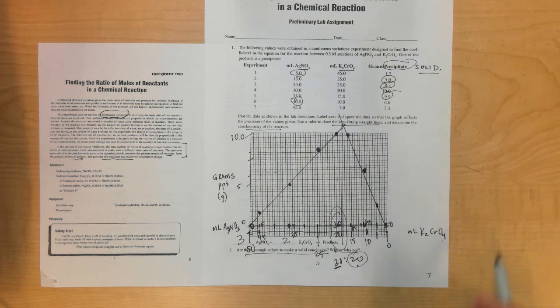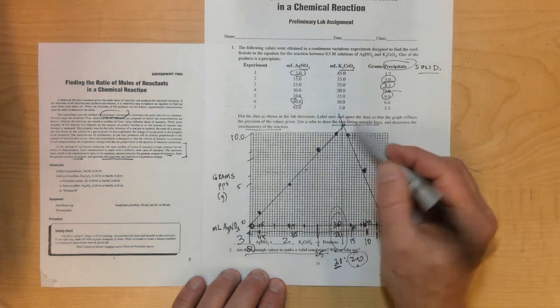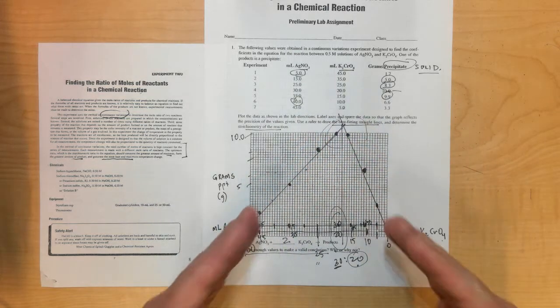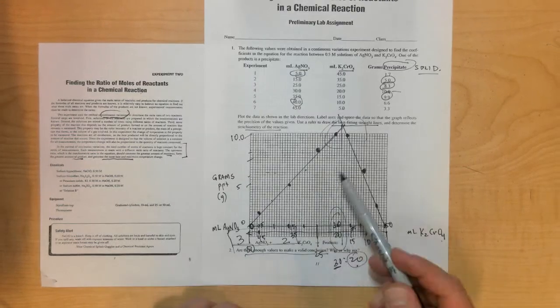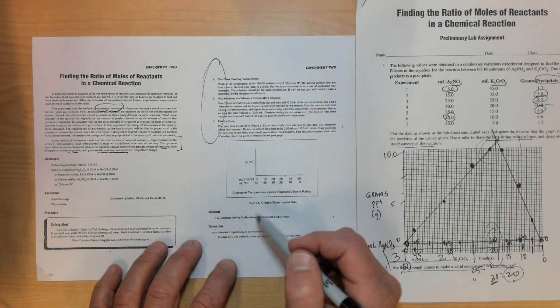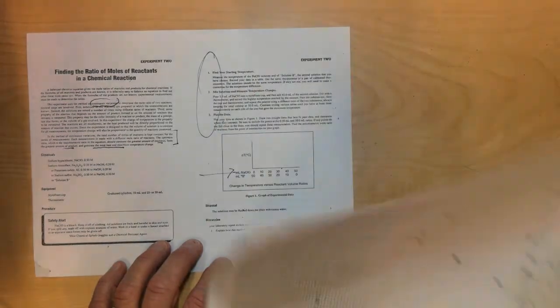And when you do the lab tomorrow, you'll have to decide how many different reactions you want to do and focus on this area right here so you can get the best peak. Now the ratio is different in the lab tomorrow, and you'll have to make your graph as you go along, but that's what this sheet is for on this side right here, where you can make your graph as you go along following these instructions right here. And then this gives you how your graph should be set up.